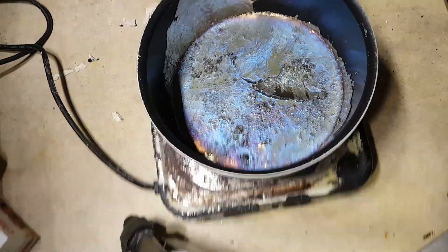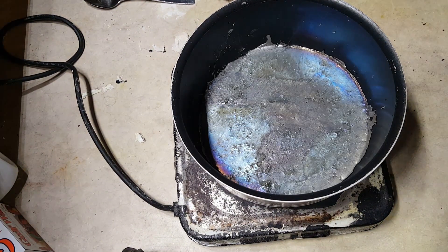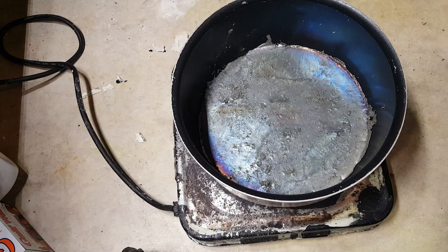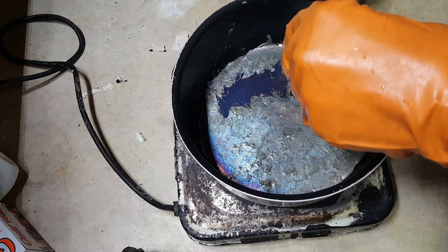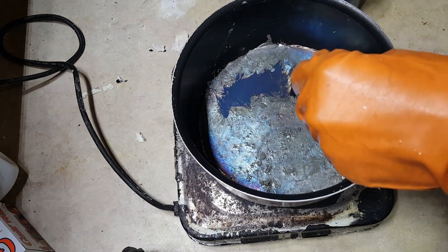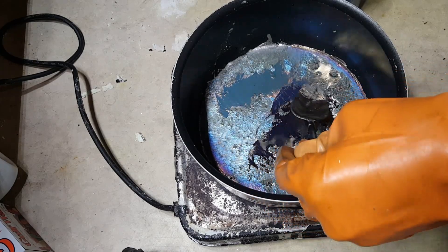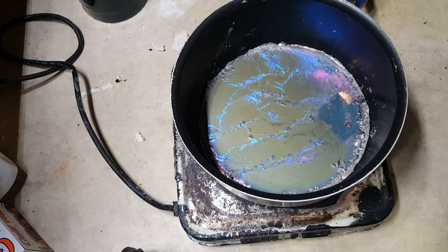I've transferred this to another container now. Let me melt the bit that's solidified here. I've still got a skin of oxides on the surface. All you need to do to get rid of these is simply skim them off with a spoon or a fork. They'll generally occur as gray or yellow powders on the surface like you see here.